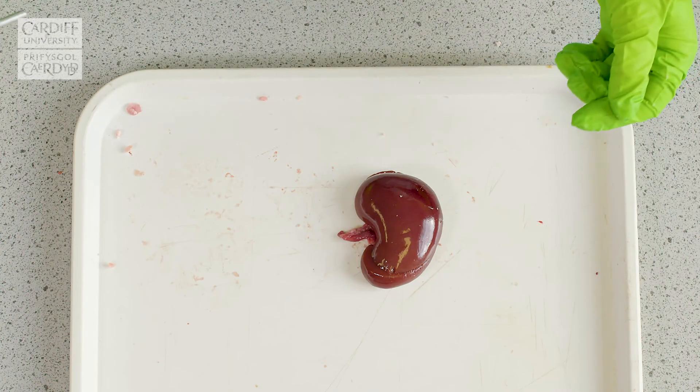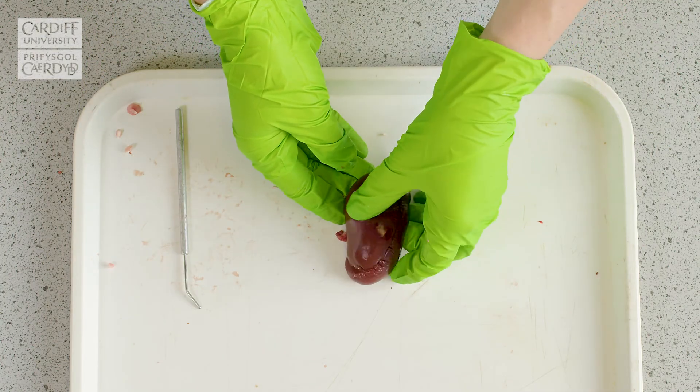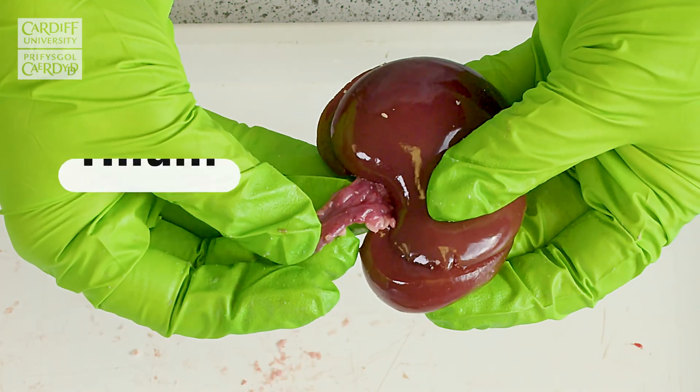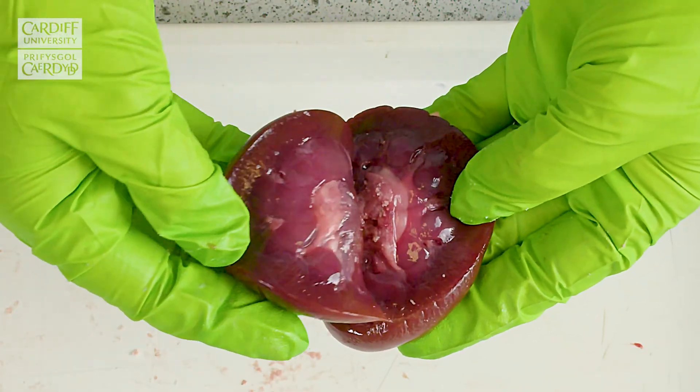Now that we've removed the fat from the kidney, it's easier to see the structure. You can see it's a nice bean-shaped structure and it's got this hilum, which as I mentioned is where the structures enter and exit the kidney itself. And if we open it, we can see the internal structures of the kidney quite nicely.